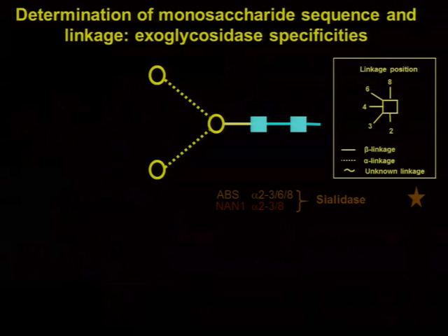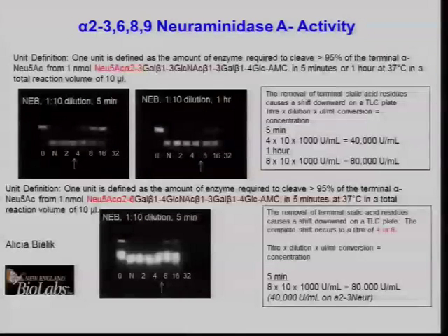So they're poles apart on the glucose unit scale. You won't mistake a 0.8 for a 1.6. And because you know you've used the galactosidase, that's the only option. Either it loses 1 whole galactose or 2 whole galactoses. So this is why it's so robust. If the glucose unit is wandering a bit, when you do the enzyme digest, you'll immediately see the difference between 0.8 and 1.6 glucose units. So it's another reason why these enzymes are just so useful.